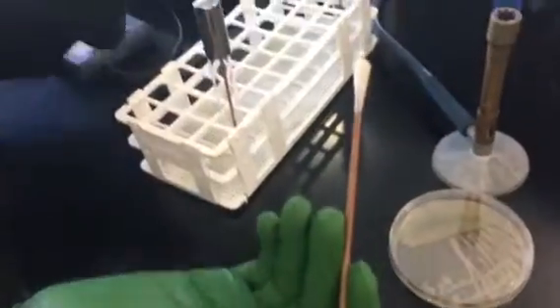Close the lid of the plate, then open the lid of your tube of saline and put in your swab.